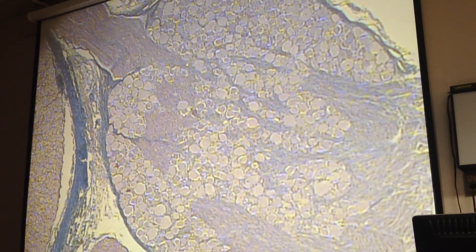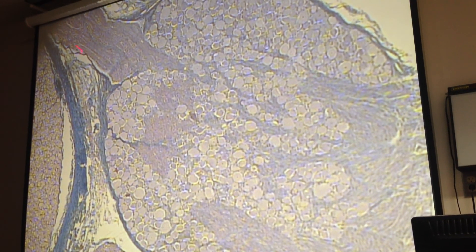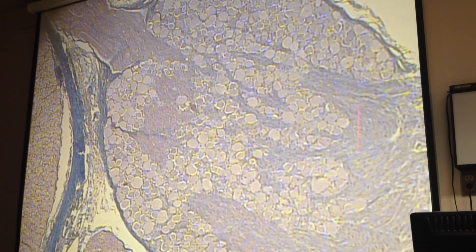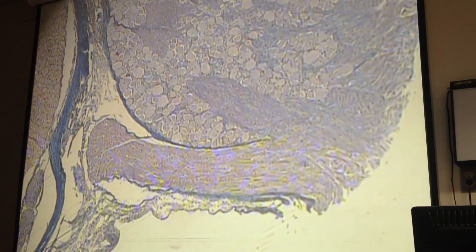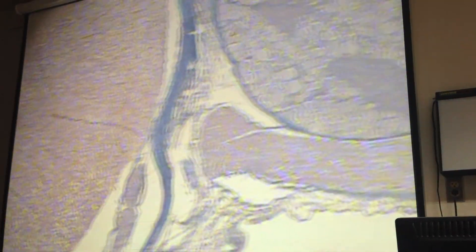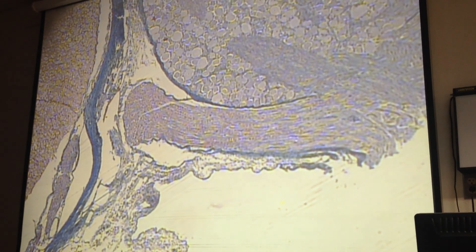So that's a specific name for that ganglion. There's other ganglia in the body. This is called the dorsal root ganglion. And those are all the little somas. So that's the cell body of the neuron, and its axon is over here. And coming out over here would be the other side of that dorsal root, and what's happening over here on this side. That's probably the ventral root. It seems to have kind of broken away from its connection to the spinal cord over here. But we can definitely see the dorsal root ganglion and the dorsal root right there.